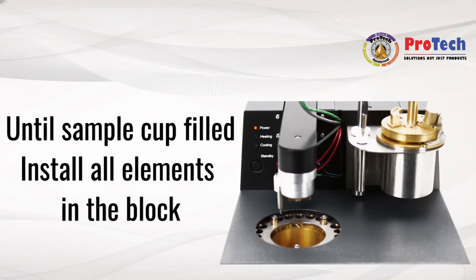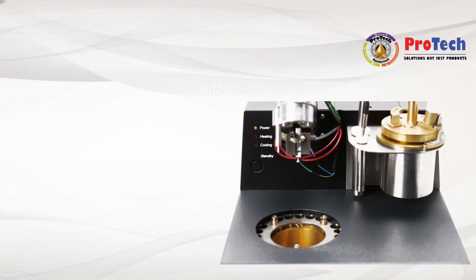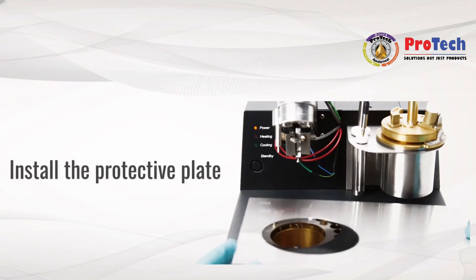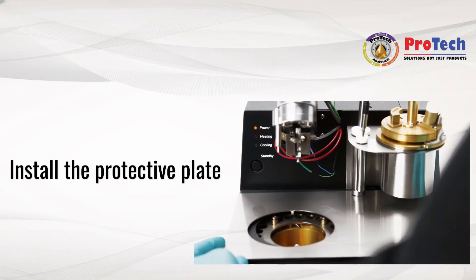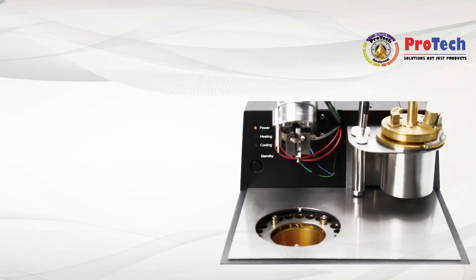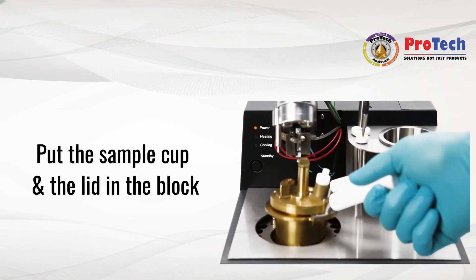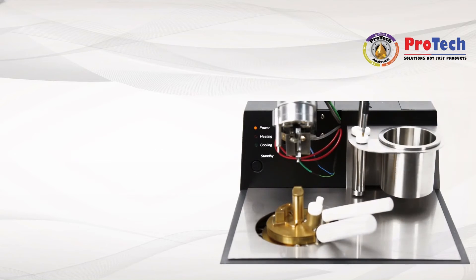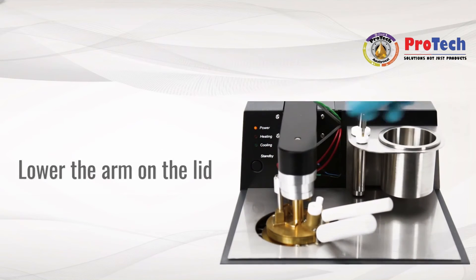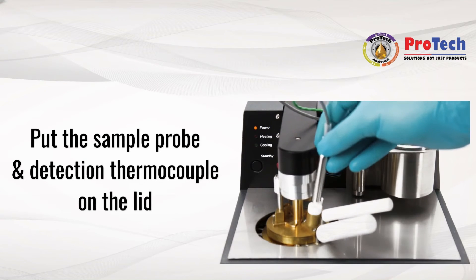Fill the cup with the sample to be tested and install all elements in the block. Install the protective panel. Insert the lid on the holder, lower the arm on the lid, and put the sample probe and detection thermocouple on the lid.